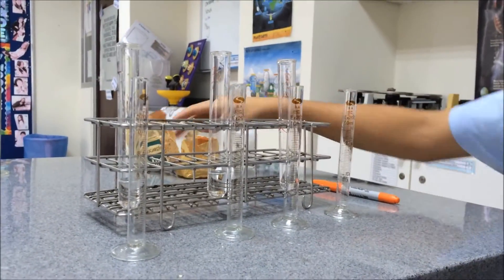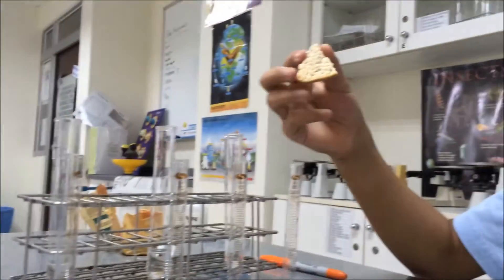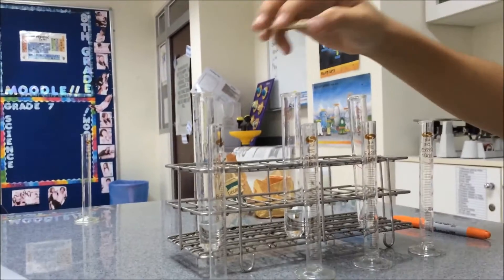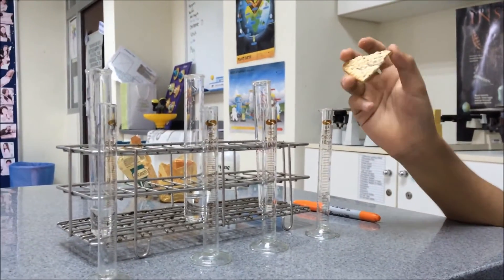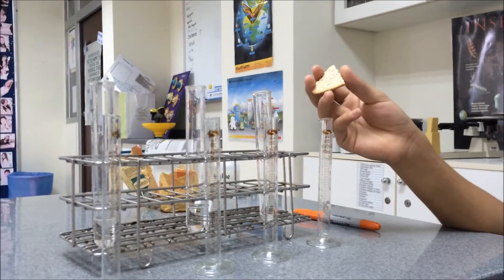In these three tubes, we're going to put biscuits into each of them. We're going to break it up and put it in each of the tubes, and we're going to see which one dissolves carbohydrates fastest.